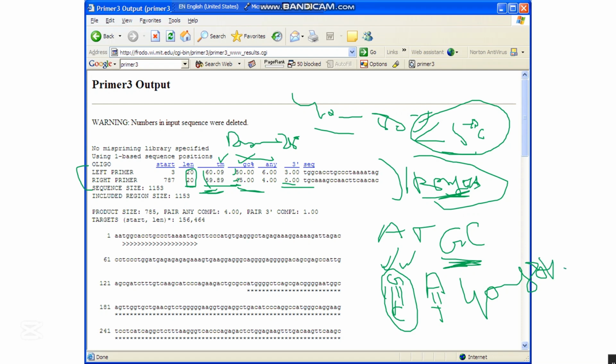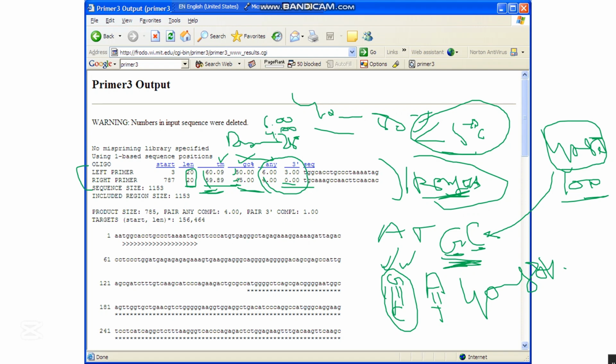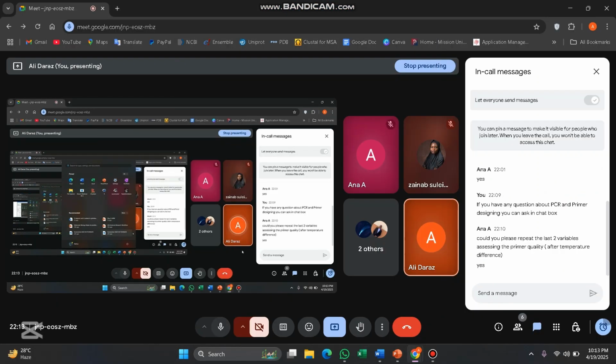What does it mean? If your primer has 100 nucleotides, for example, then about 40 to 50 nucleotides must be either G or C. And the two TM values must be close to each other, like 60 and 59, the difference is 1. It must be less than 5. The primers we got here are very close to each other, and the lengths are almost the same. So I think your question is answered.